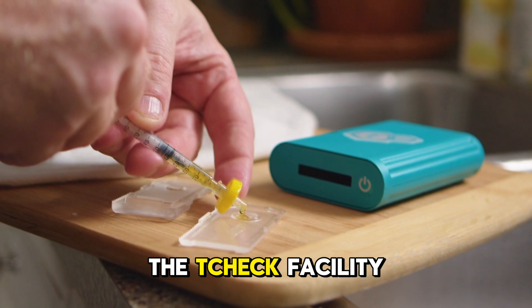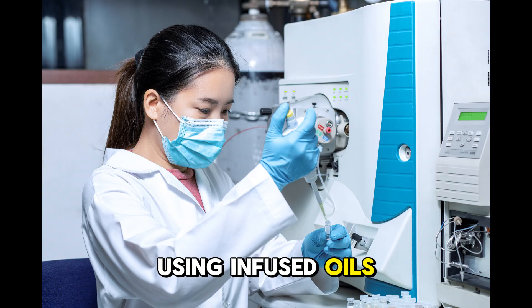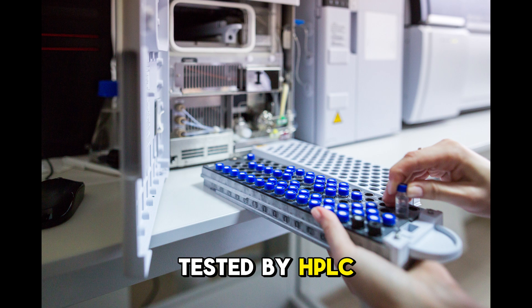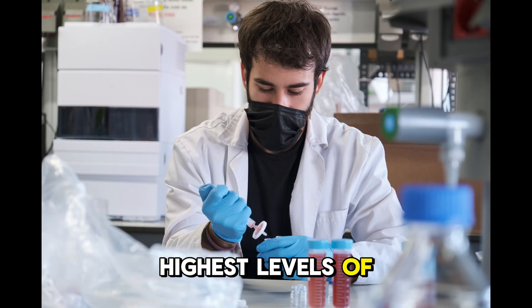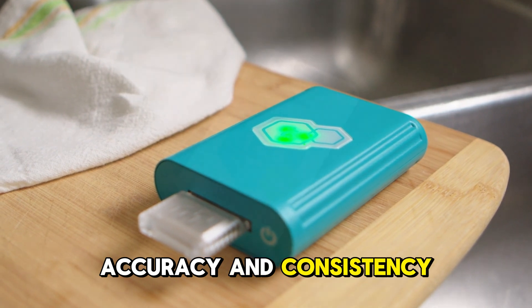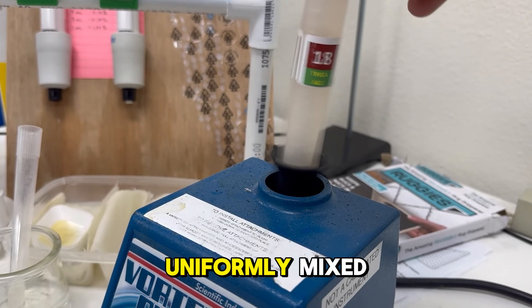Here in the T-Check facility, we individually calibrate each T-Check device using infused oils that have been tested by HPLC at two ISO certified labs, and in order to get the highest levels of accuracy and consistency, we use several different machines to ensure that the oils are uniformly mixed.